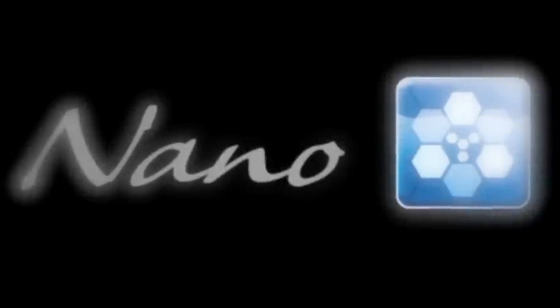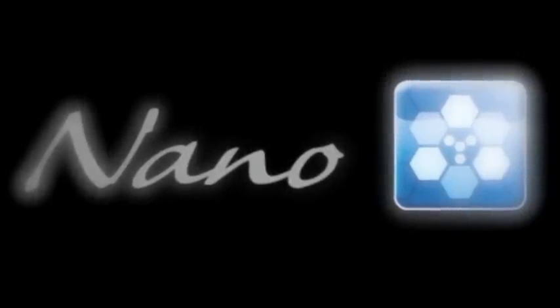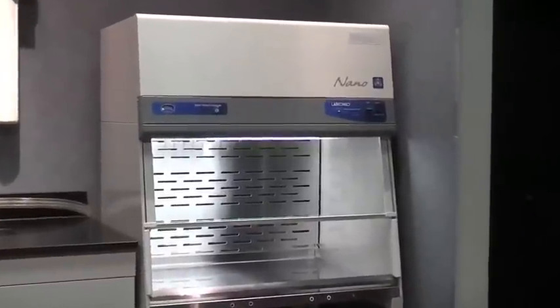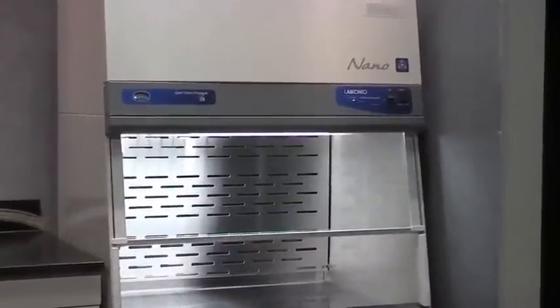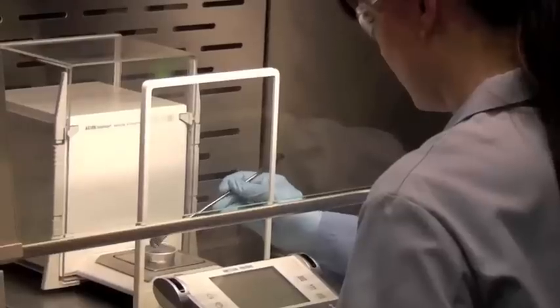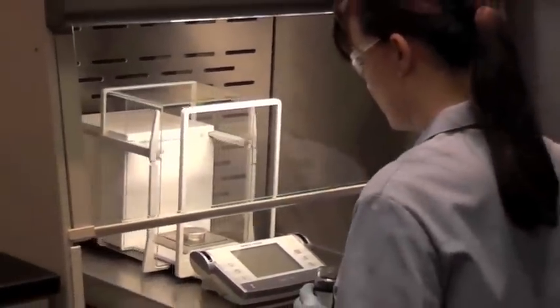The LabConco Expert Nano enclosure provides user protection by keeping hazardous powders and particulates contained during procedures such as nanoparticulate manipulation and dry powder chemical handling. The Expert Nano is the first and only enclosure to be validated for nanomaterial containment, as tested by NanoSafe Incorporated.